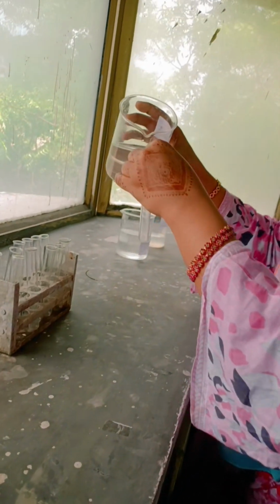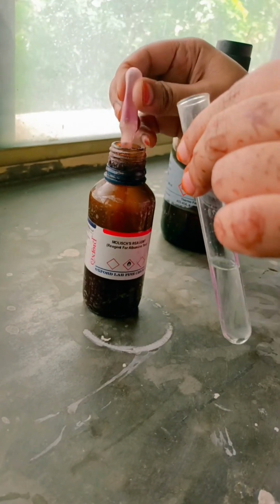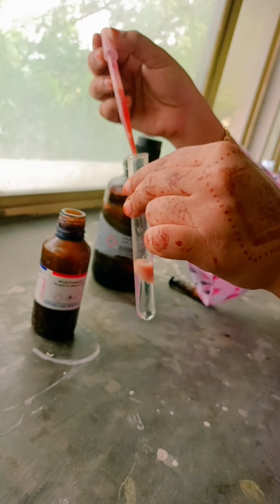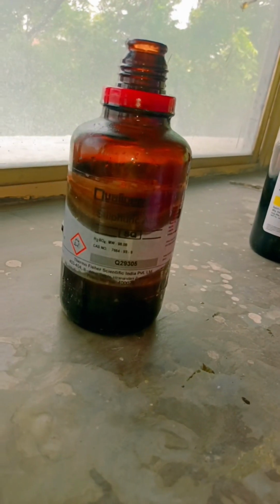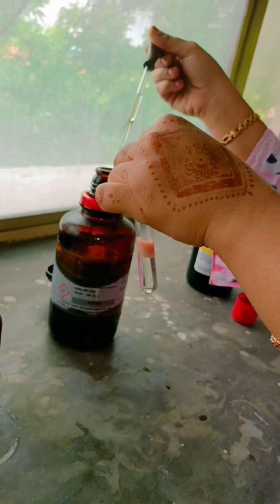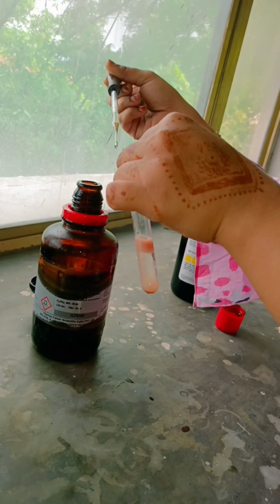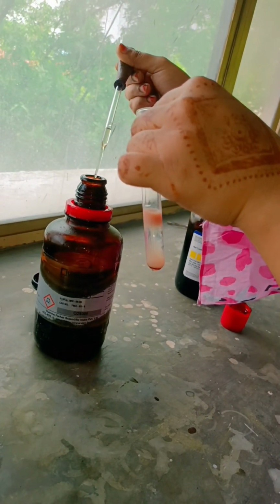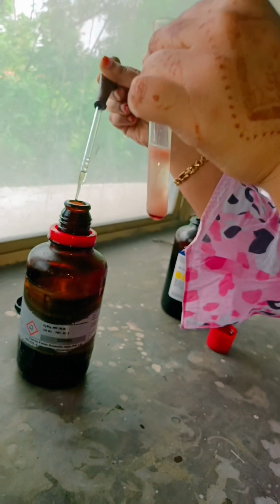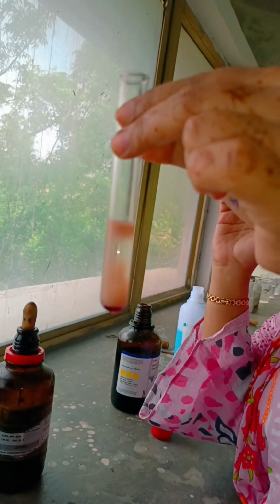Let's perform the analysis now. You have to take the sample. To the sample, add Molisch reagent in which alpha naphthol is present, followed by sulfuric acid along the walls of the test tube. This alpha naphthol reacts with sugar in the presence of sulfuric acid to give rise to a purple ring at the junction of two layers if at all the sample contains carbohydrates. And clearly you can see the purple color ring has formed at the bottom. As you can see here, the purple coloring has formed, so it is positive for the presence of carbohydrates.